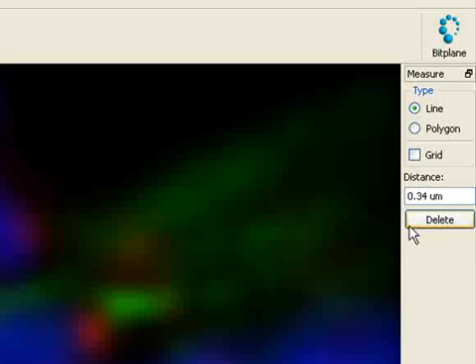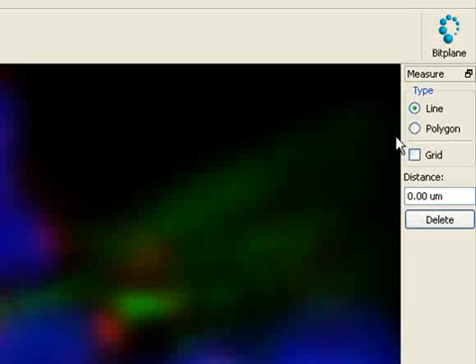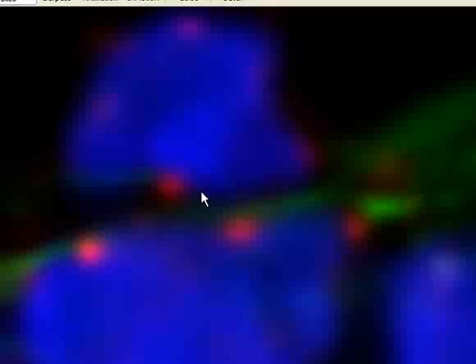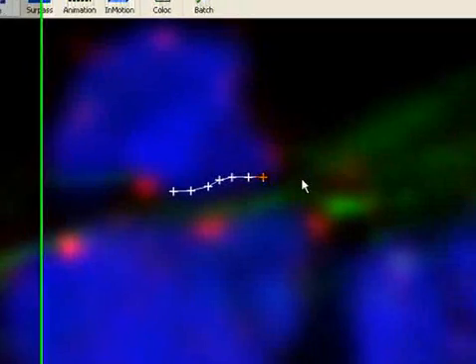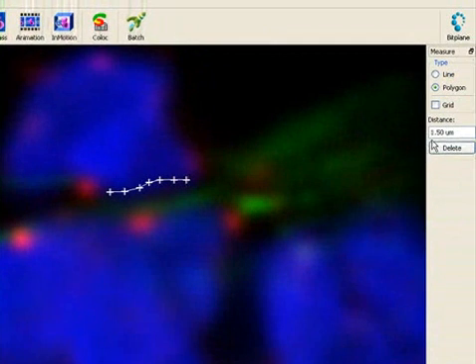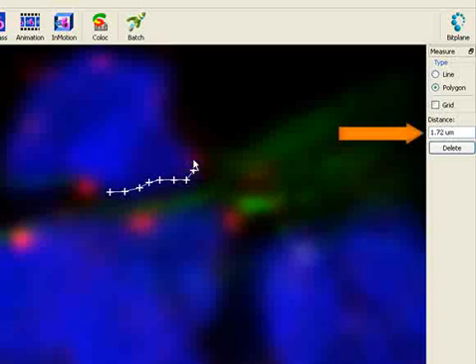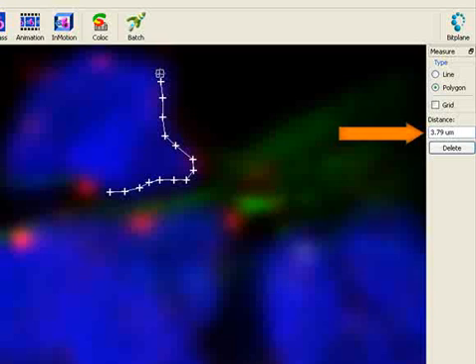To measure the perimeter of blue stained DNA, choose the measurement type polygon. Switching to polygon mode allows you to connect more than two points. Click on the first point and continue clicking. Lines consecutively connect all measurement points and the distance is presented as a total sum of all the distances measured as you go along. With each new click the sum of all distances is updated.